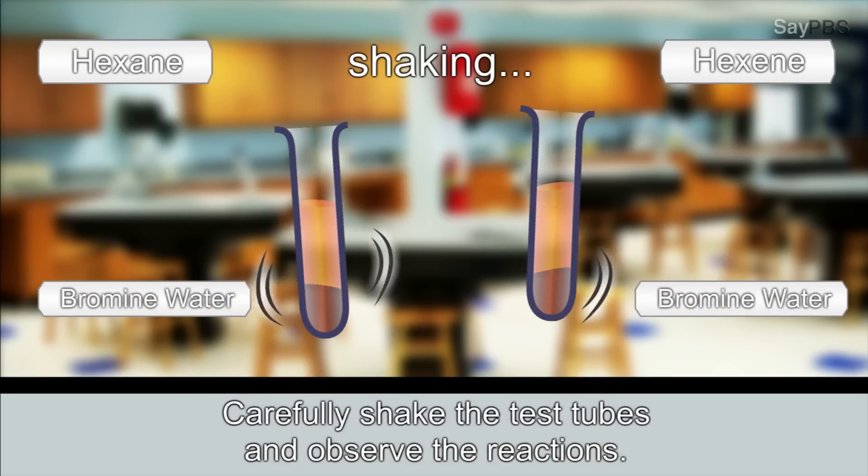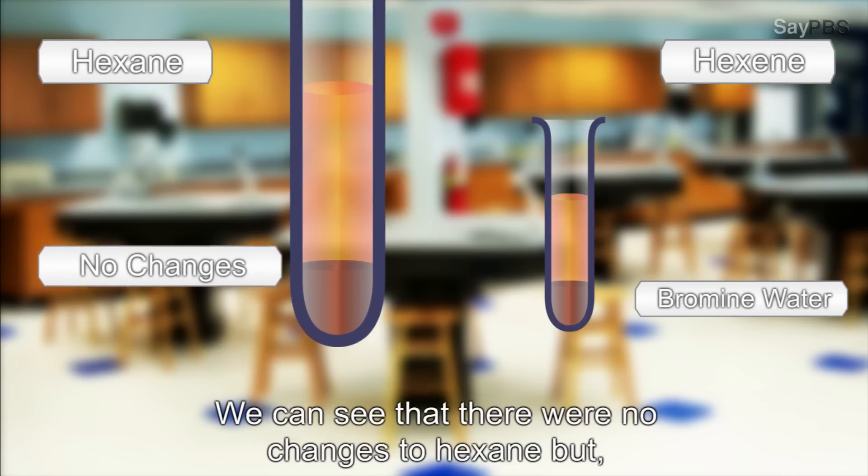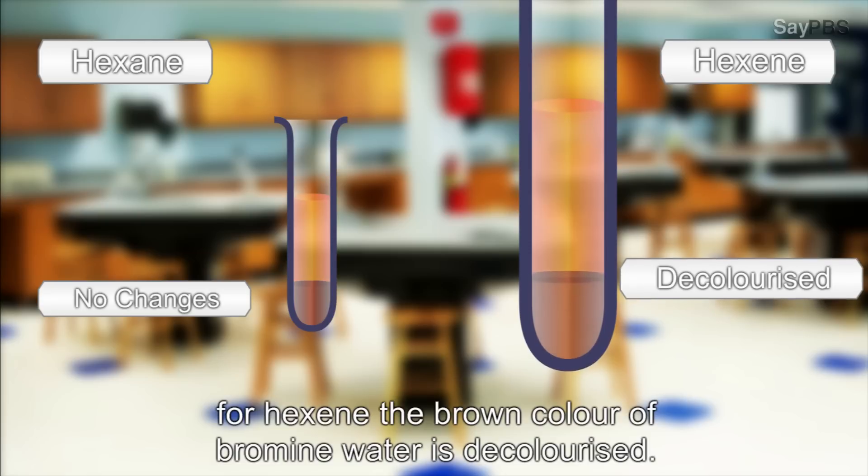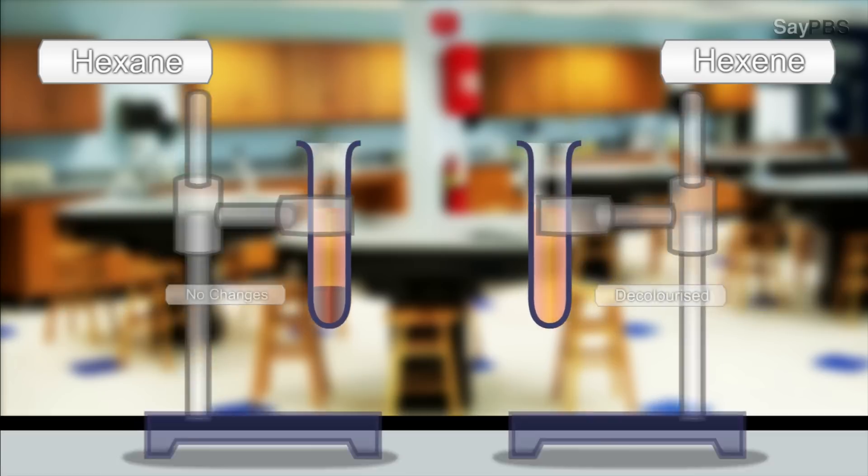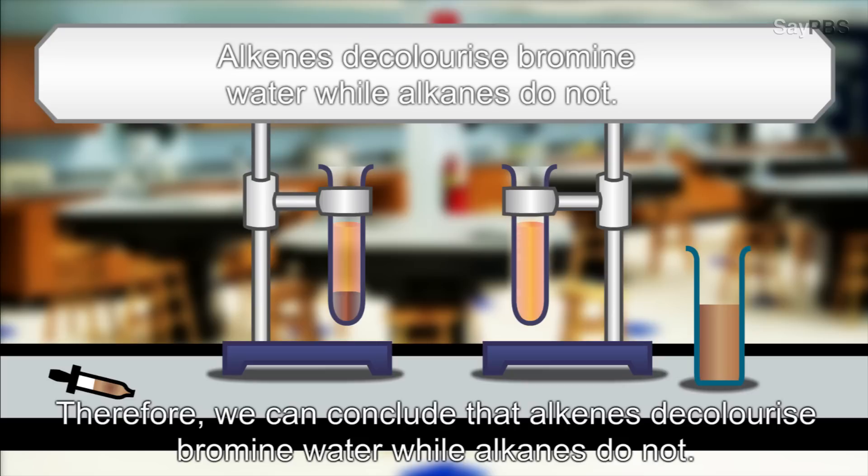Carefully shake the test tubes and observe the reactions. We can see that there were no changes to hexane. But for hexene, the brown color of bromine water is decolorized. Therefore, we can conclude that alkenes decolorize bromine water while alkanes do not.